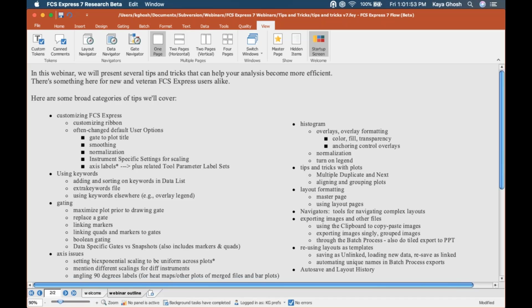I think whether you're a newbie or a veteran FCS Express user, you will probably learn something that you didn't know. And we might do another one of these webinars in the future because I didn't even include all the tips and tricks. I've just included some of them that I think are going to be useful for a lot of you. But there's so many settings and features in FCS Express that we couldn't possibly cover all of them.